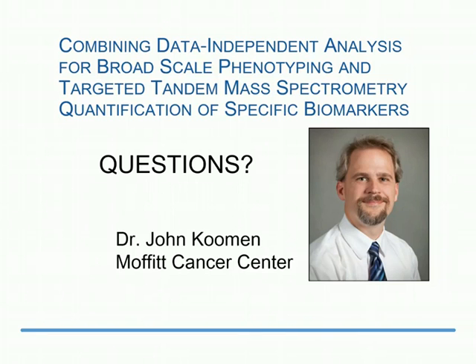All right, next up is, how do you measure the protein content from a TMA sample? Yeah, so this is a very big challenge. To this point, we haven't done that. We've just digested everything and tried to load it straight over. One of the things we're working on is using an algorithm like Genie to evaluate the amount of tissue cellularity and stromal content in that slide, and then link that to the amounts of intracellular or extracellular proteins that we see, as an example.